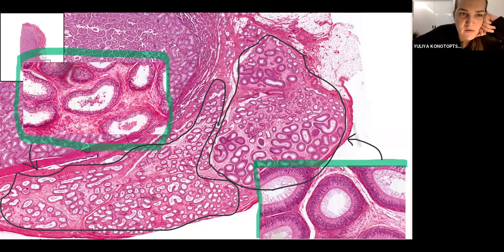So this is a magnified picture of this area, and this is a magnified picture of this area. So if you look into this area, you see that there are some cells that possess some kind of apical domain modifications. And right under this apical domain modification, you can see there's a sharp red line. So this sharp red line should be basal bodies.